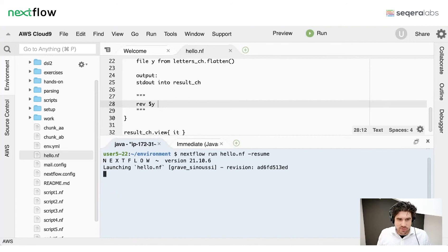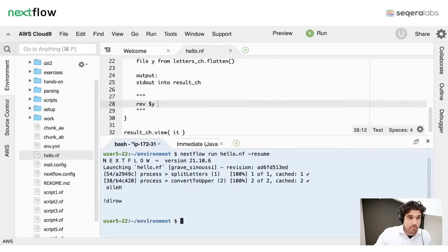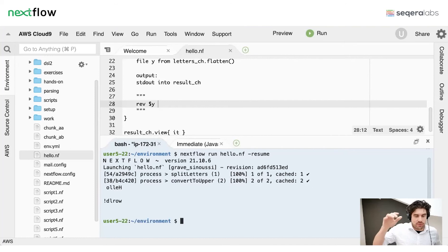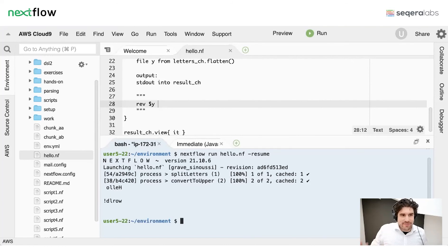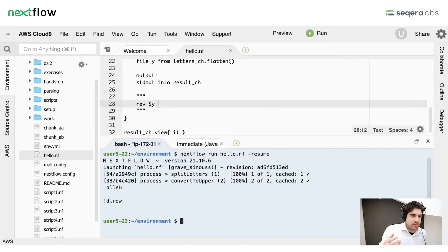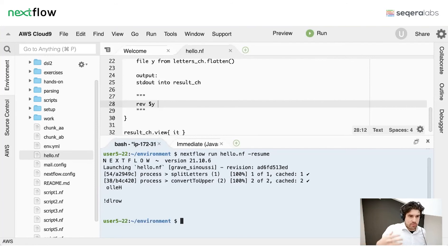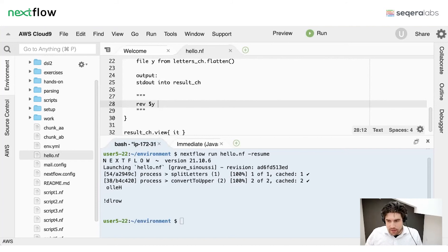Running with resume again, you can see that both processes are now cached — no compute was actually done. Imagine each of those tasks running on a cluster: Nextflow says everything is successful, no need to rerun. You can even add files: imagine a clinical trial with a massive pipeline run for five patients, then a sixth patient is enrolled. You add that patient as input and rerun — all data for the five existing patients won't need to be reprocessed. Only the new patient is added. This is a very powerful feature.